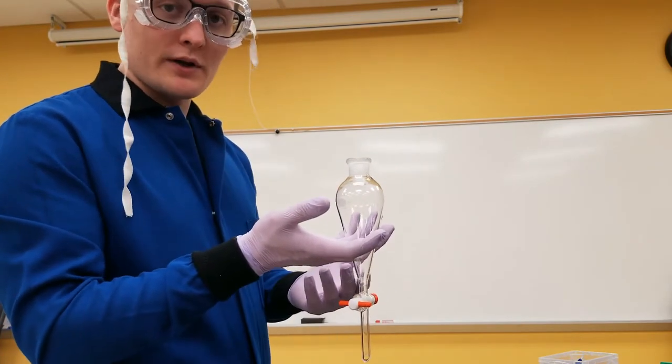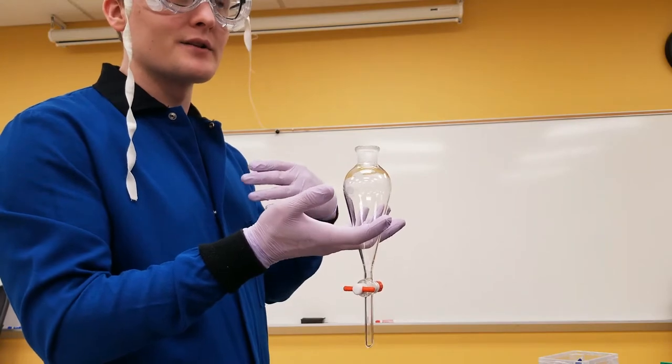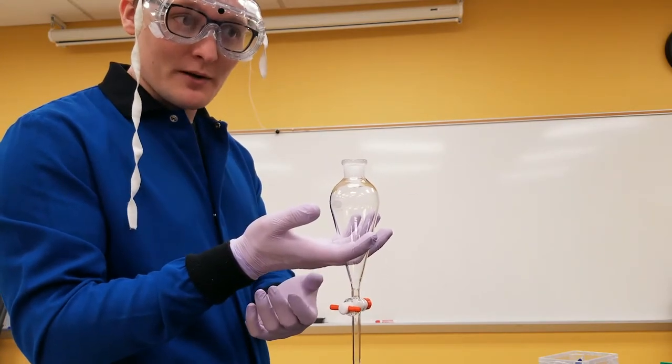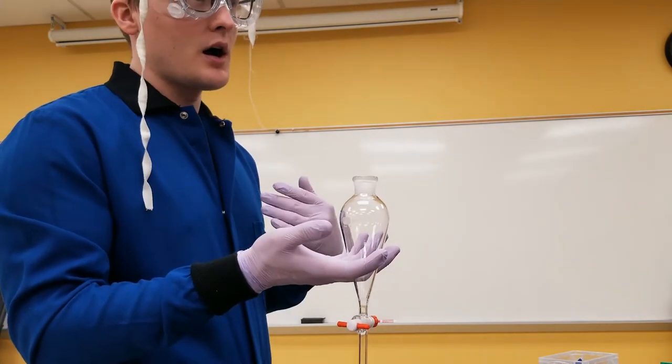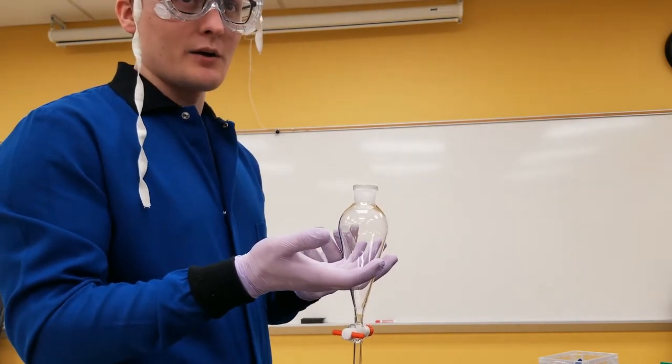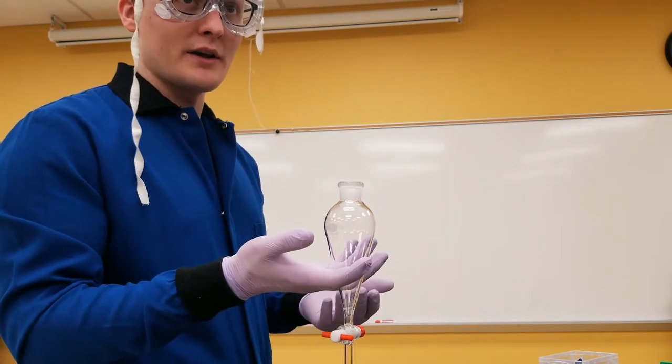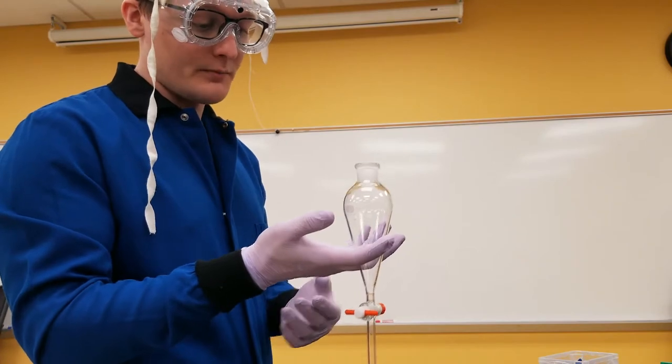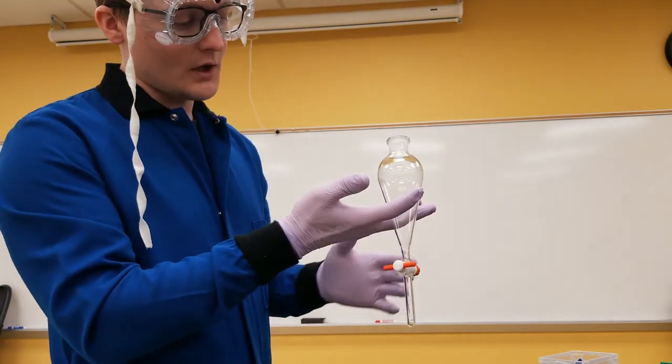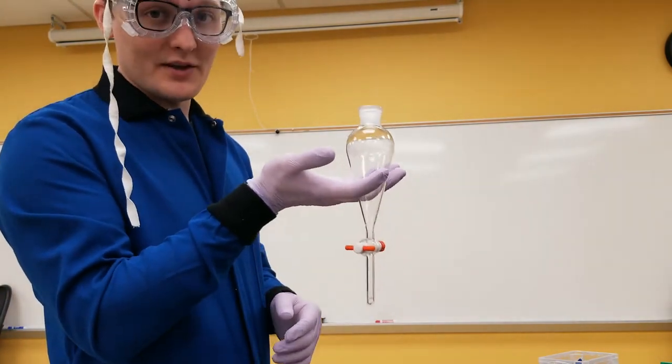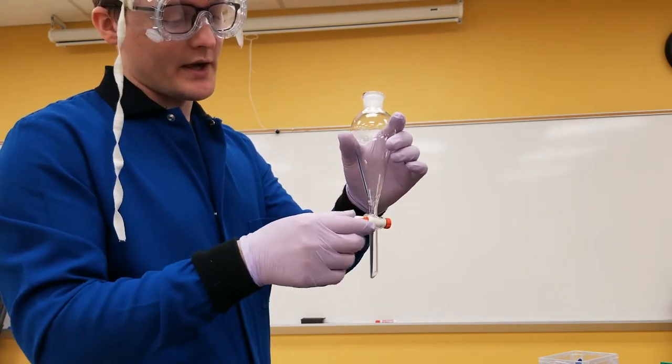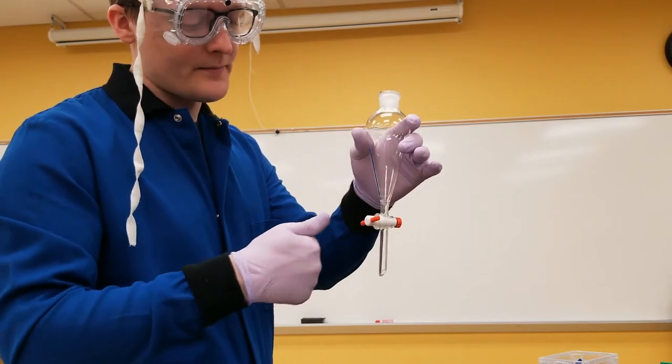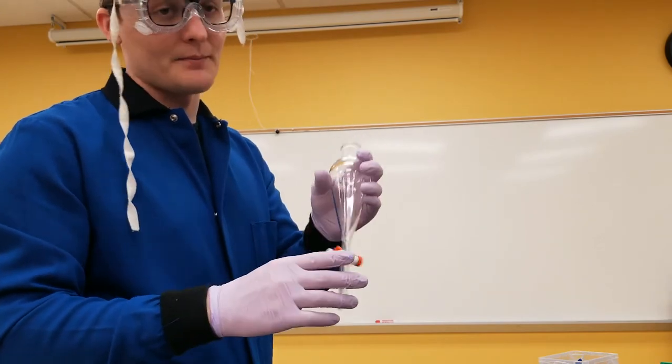Depending on what you're working with, sometimes you need to give the layers time to form. Maybe the solvents have intertwined with each other quite a bit, and it's going to take a while for them to separate. I think today, with caffeine, we're using a water-based mixture and DCM, which separate rather quickly. At the end, once the layers have separated, then you can take out the bottom layer by letting it through into some kind of collection container. And then you take out the top layer the same way.